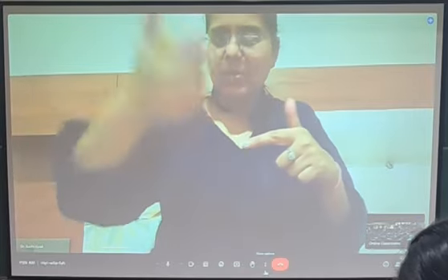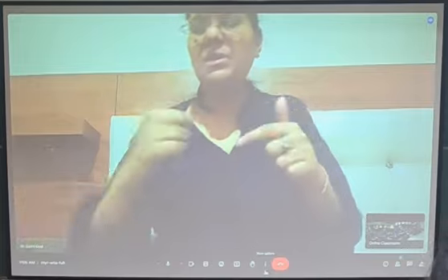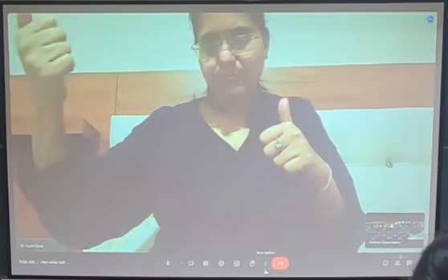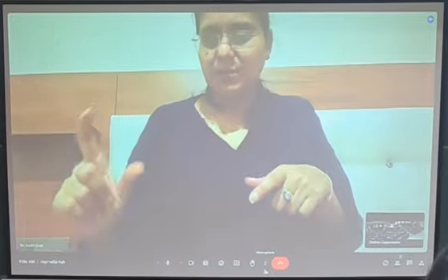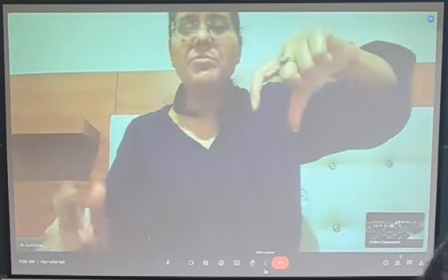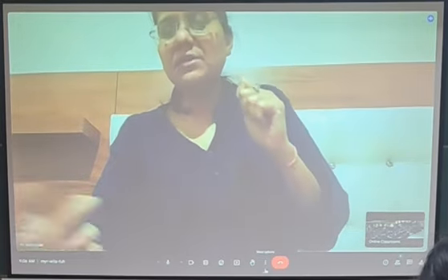I take 1 ml of the sample after 20 minutes because the replication time is 20 minutes. If the OD becomes 0.1 or 0.2, that takes 5 minutes. So measuring turbidity takes only 5 minutes. I need to take out an aliquot of the sample and just take the OD.